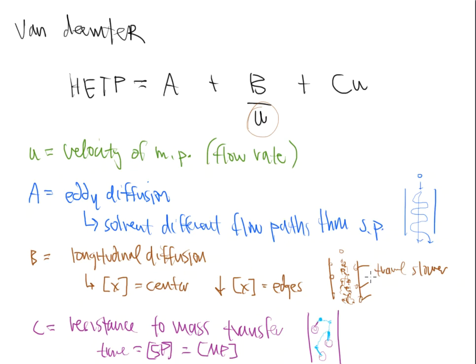And this whole concept will go back and forth the entire time, right? That's basically what goes on in the world of chromatography. And we call that mass transfer. So there's a time that equilibration happens. And that time is in reference to the stationary phase and the mobile phase. The velocity of the mobile phase is very high, right? So the mobile phase is getting pushed through the column, and that has a certain speed associated with it. So that's why we see the U show up with this variable as well, because we're talking about speeds when it concerns stationary phase and mobile phase.